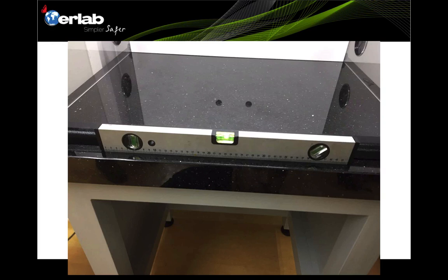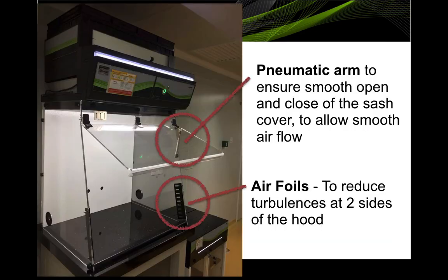The ERLAB CaptureSmart filtered fume hood comes with a stability table with a graphite worktop, which is well levelled. The design is optimized for weighing applications. You get pneumatic arms to ensure the sash cover opens and closes as smoothly as possible. You also get airfoils on the two sides of the opening to reduce turbulence at the sides of the hood. At the top of the filtered fume hood, you get HEPA filters and also carbon filters — HEPA filters for powders and carbon filters for toxic vapors.